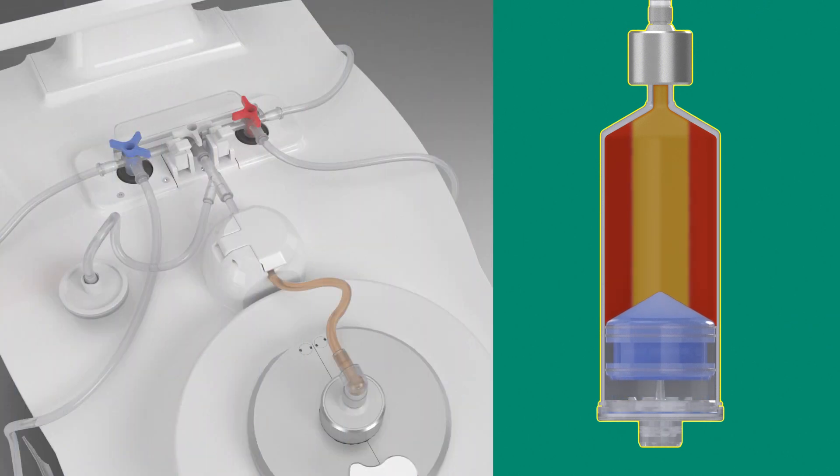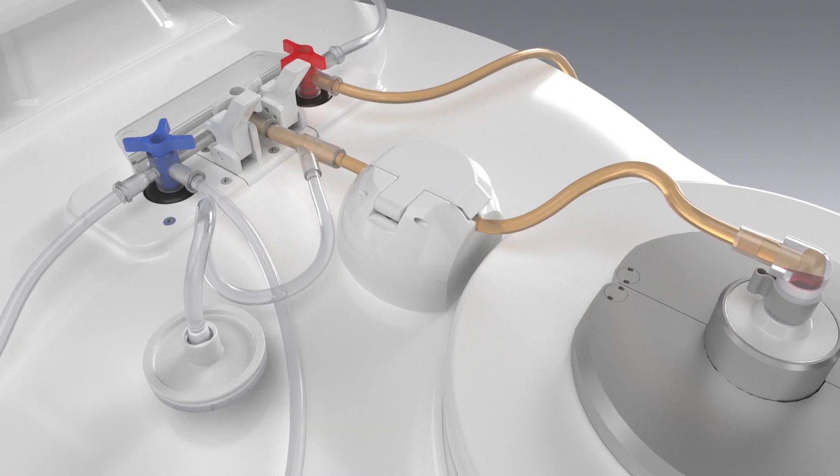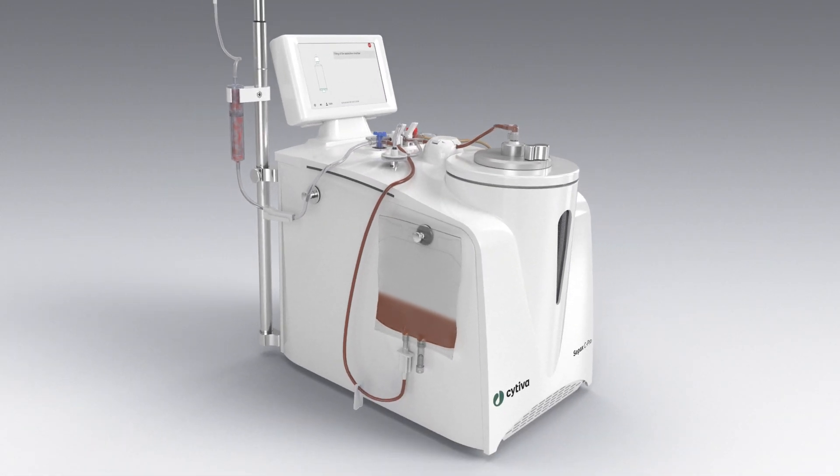When the piston moves up, the system extracts the plasma located along the spinning axis into the waste bags. Then, the system extracts your cells into the final bag and dilutes them with pure plasma to reach the final volume you need.